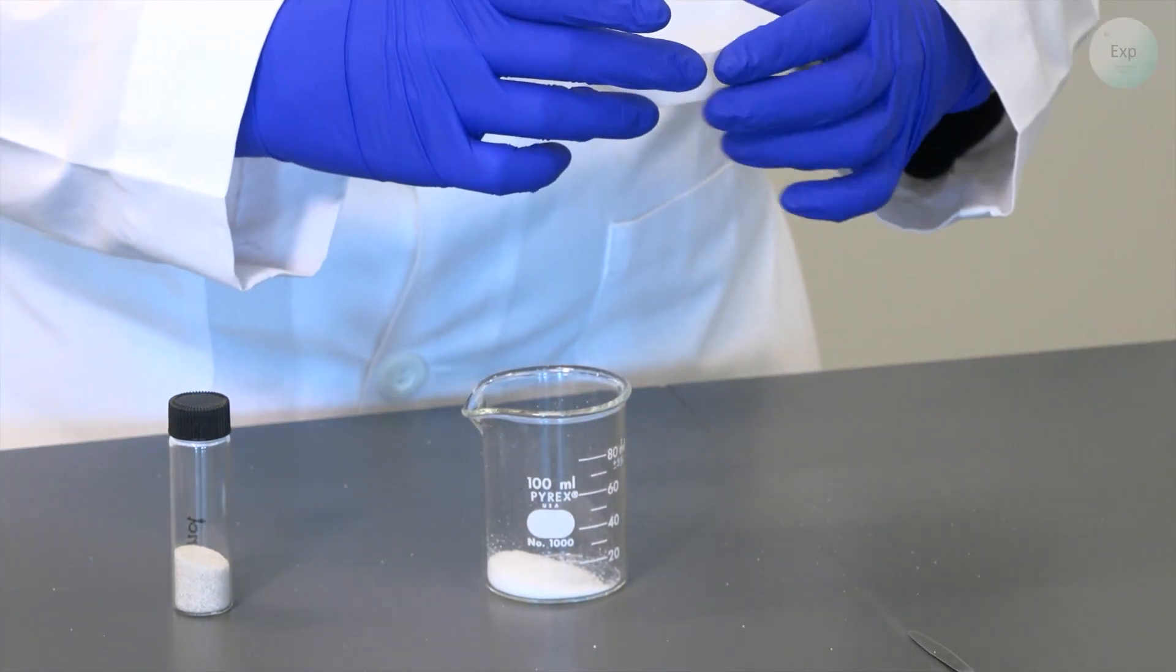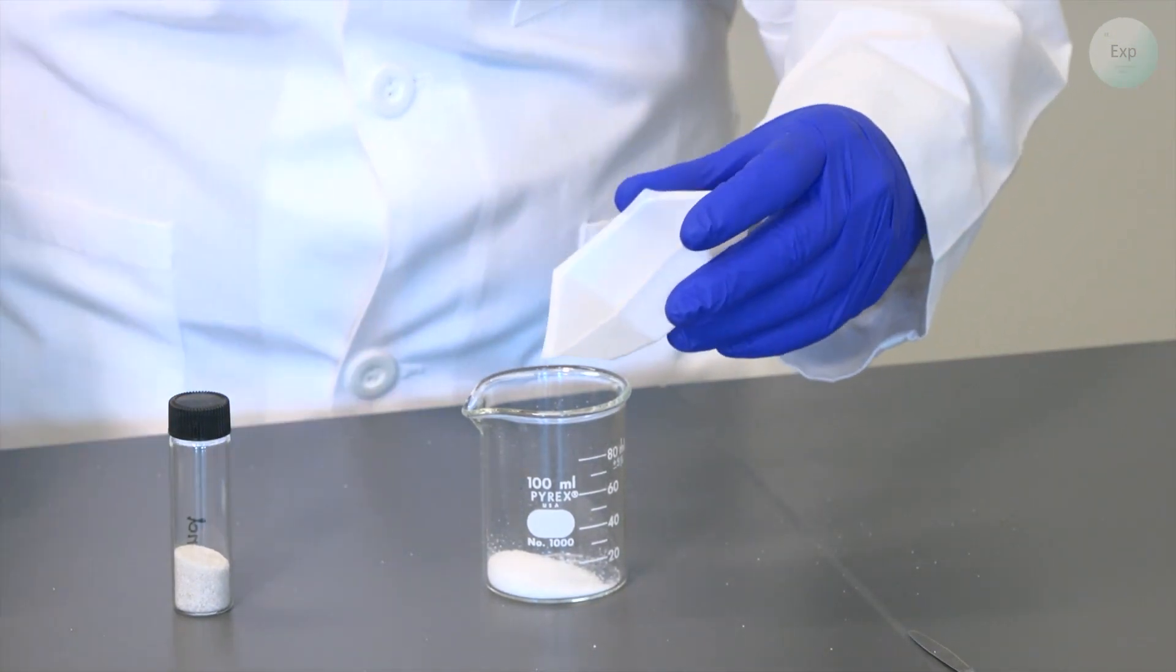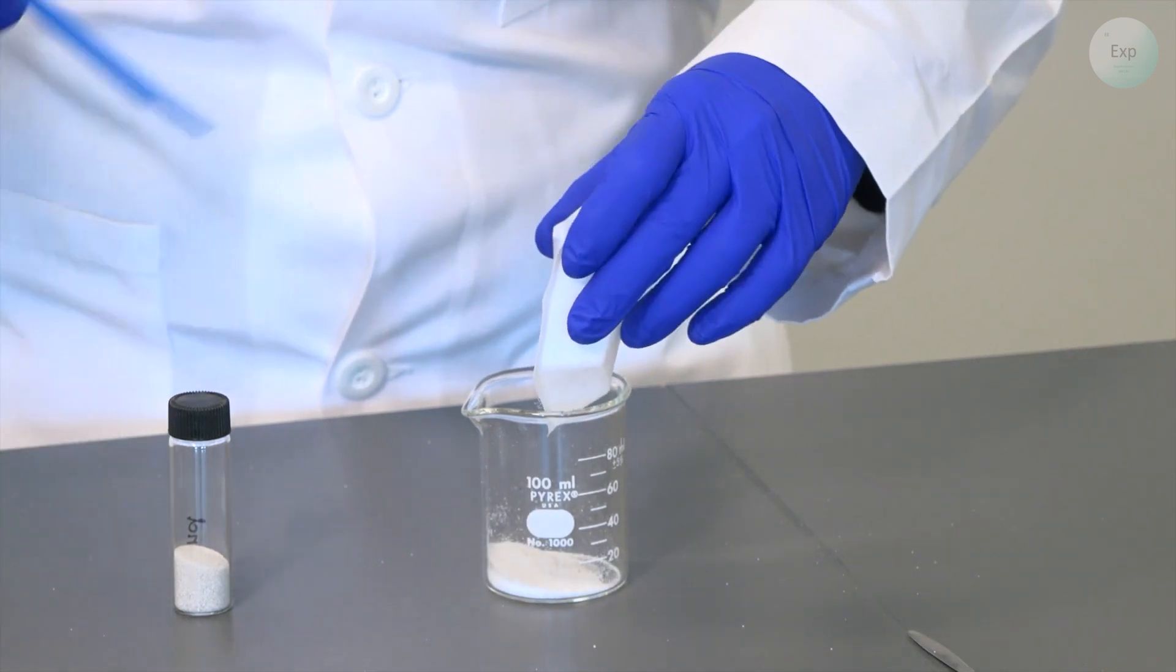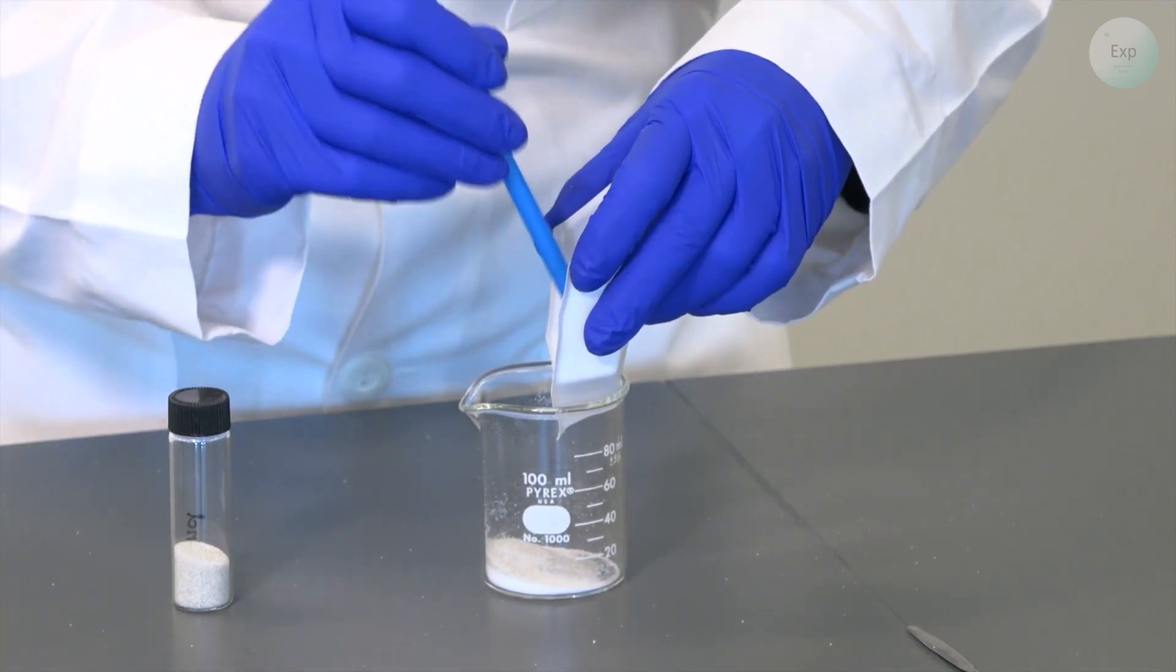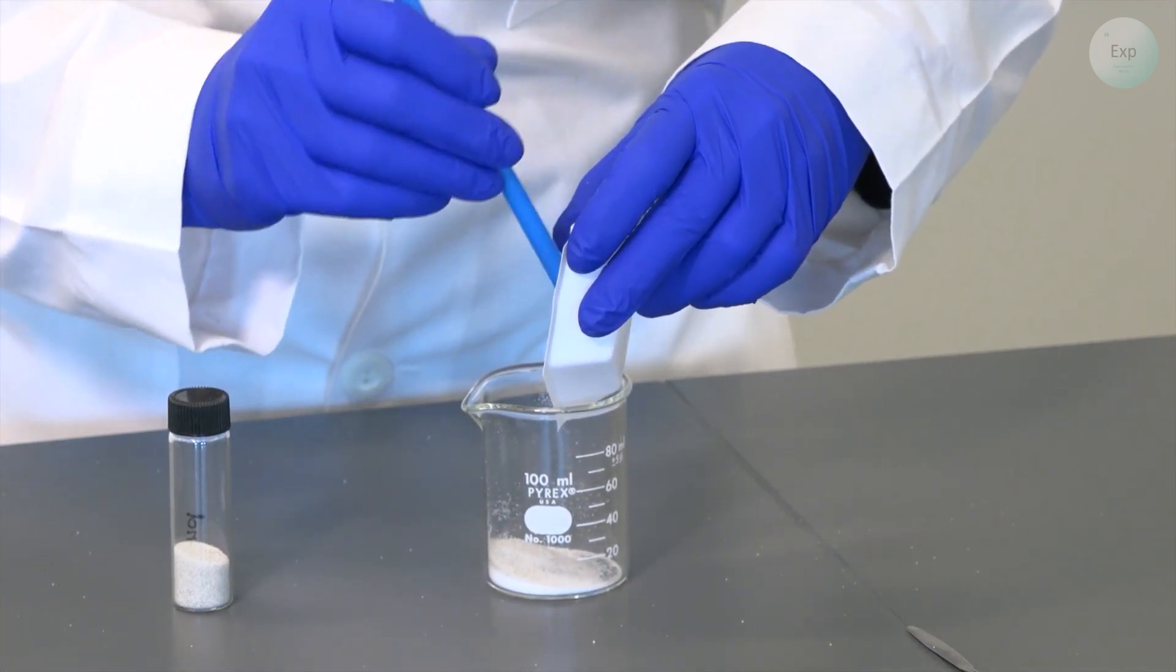Next, I am going to transfer my approximately 5 grams of sand into the container. And if there is something stuck to the weighing boat, I can always scrape it with the spatula I used to weigh out the sand.